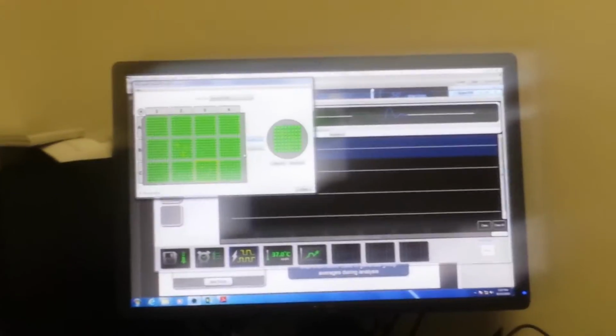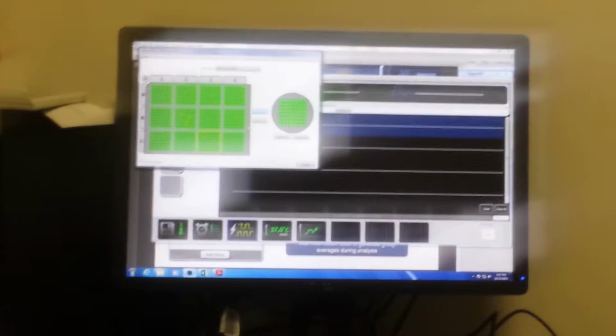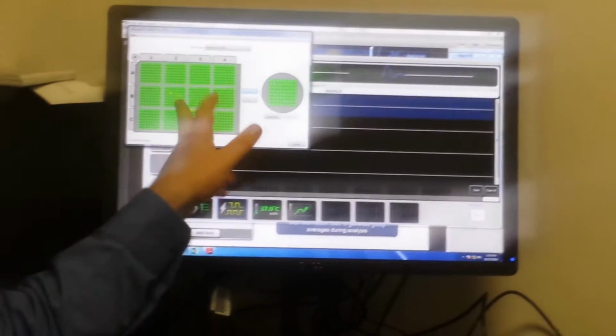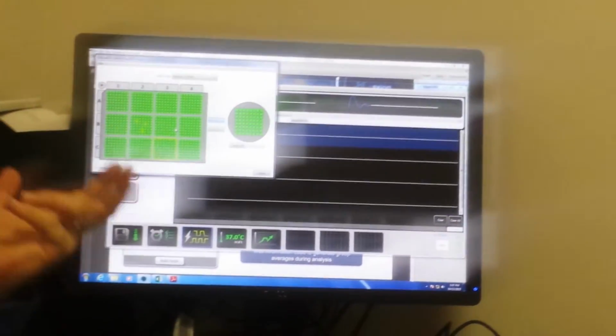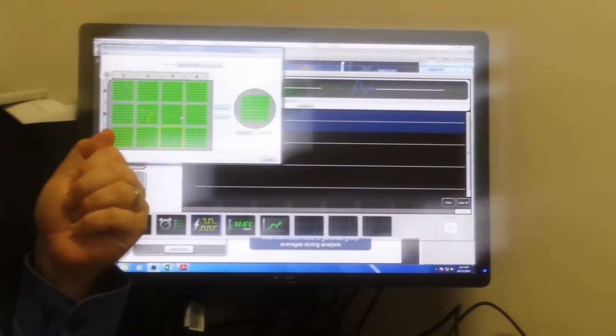Why do you actually give a special pattern of stimulus? So this pattern is random. I mean, does it make more sense to stimulate all? So one, you've got a limited number of electrodes. The other, typically you'll stimulate an electrode that has a nerve.